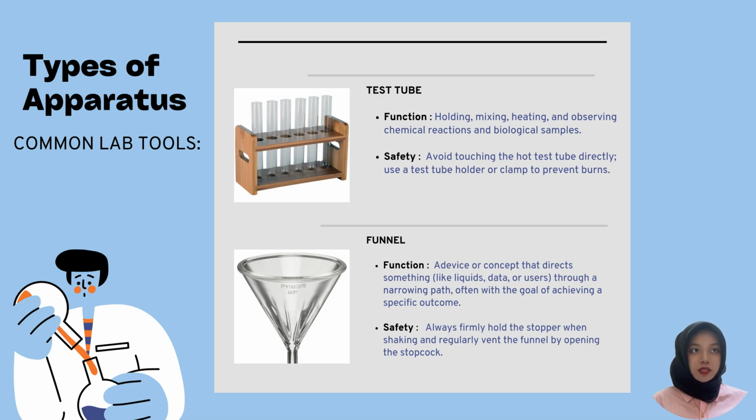In addition, for the common lab tools, we have test tube. Its function is holding, mixing, heating, and observing chemical reactions and biological samples. As for the safety, we should avoid touching the hot test tube directly. Use a test tube holder or clamp to prevent burns.